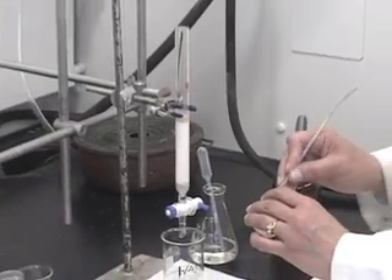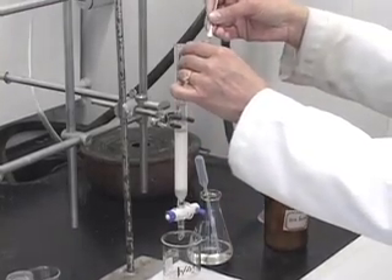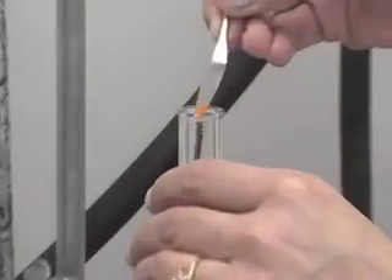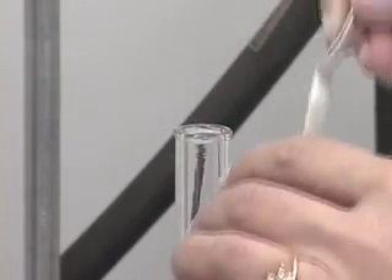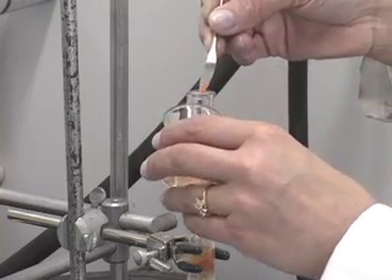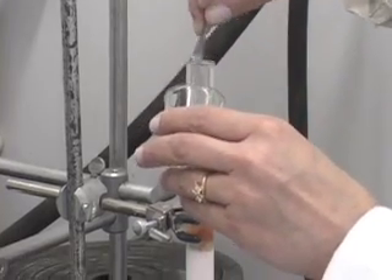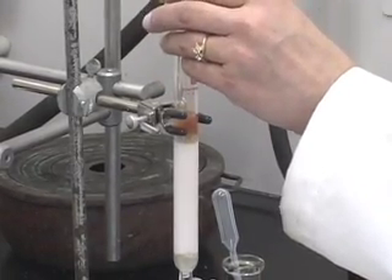We are going to load this sample — that is what it is called — load the sample onto the column. Use a spatula and carefully transfer the sample. If you want to use a funnel, make sure the funnel is very dry. If it is wet with solvent, the sample will stick to the funnel. Then you will have to rinse the funnel with more solvent, which is not very advisable. The rinsing has to be done with a minimum amount of solvent.